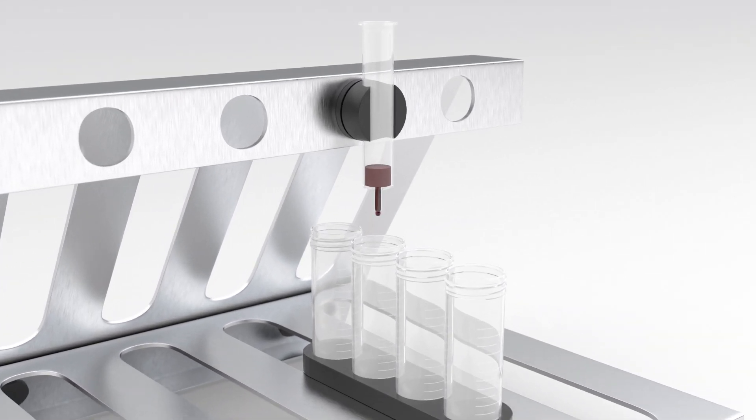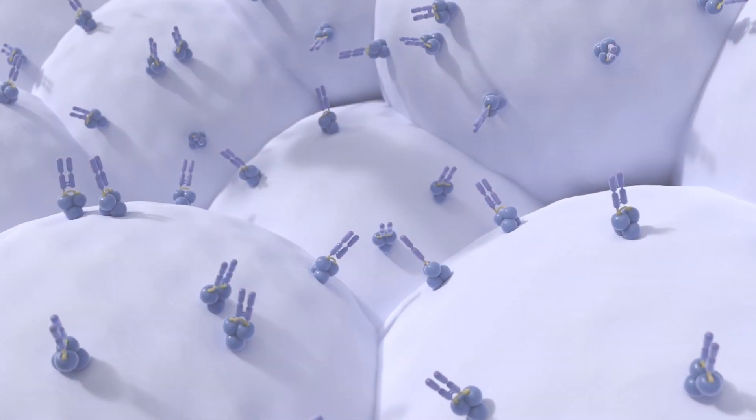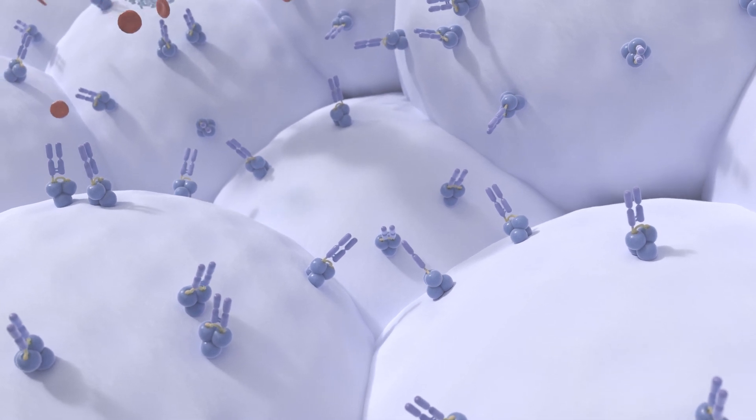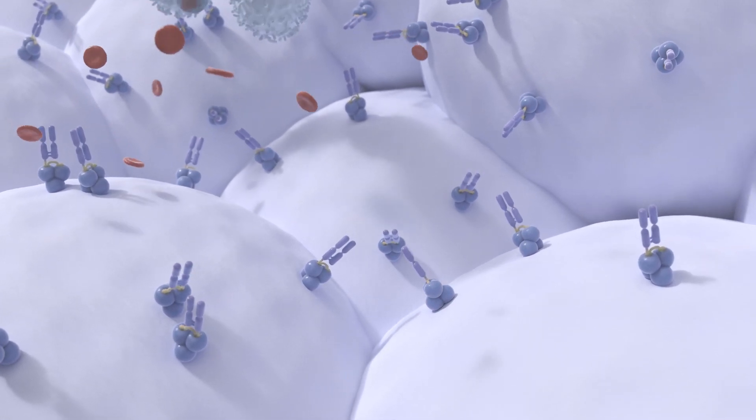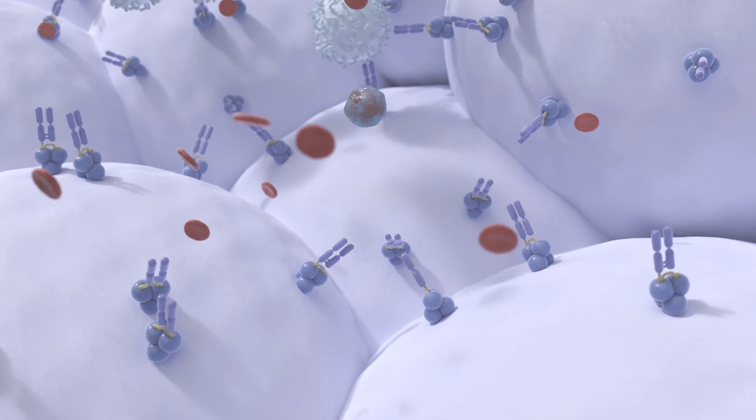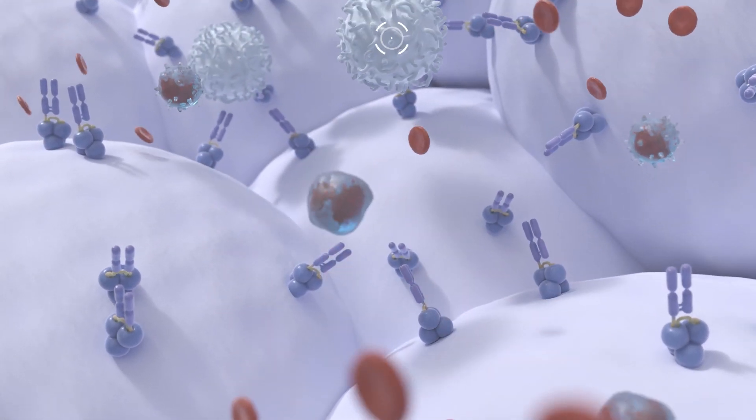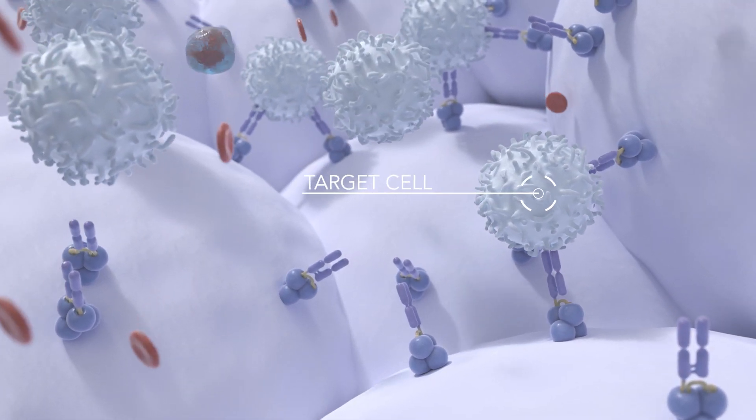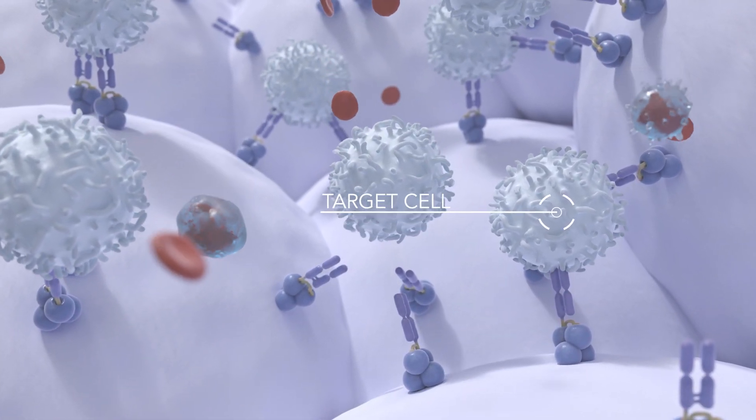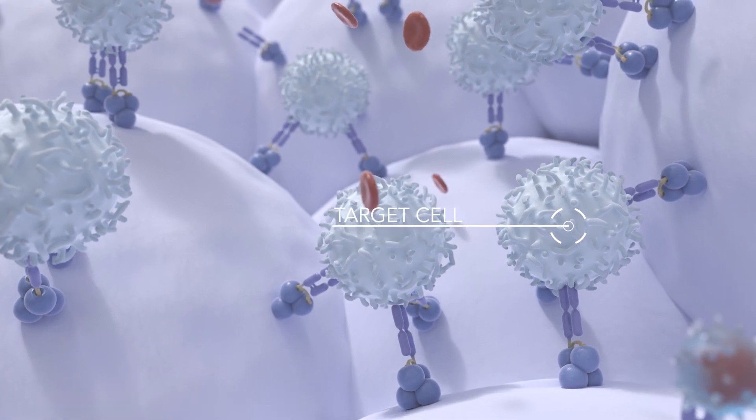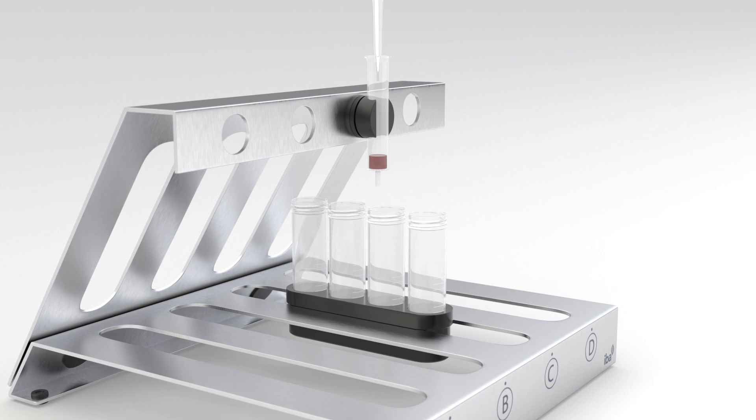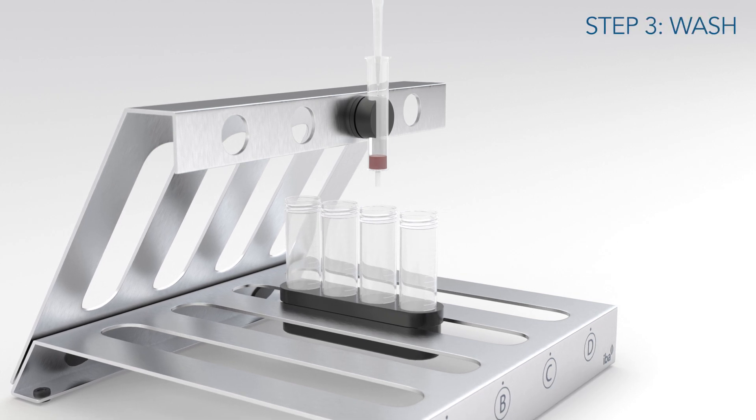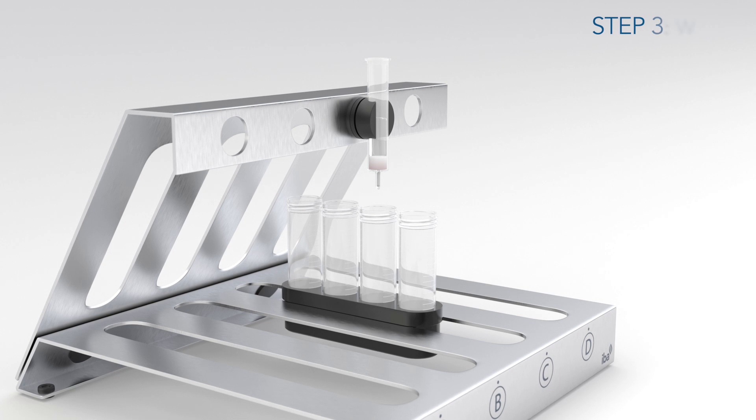When a single-cell suspension is passed through the column, target cells adhere to the affinity matrix based on the exclusive binding of the fab strep to the target cell. Non-target cells are washed away efficiently.